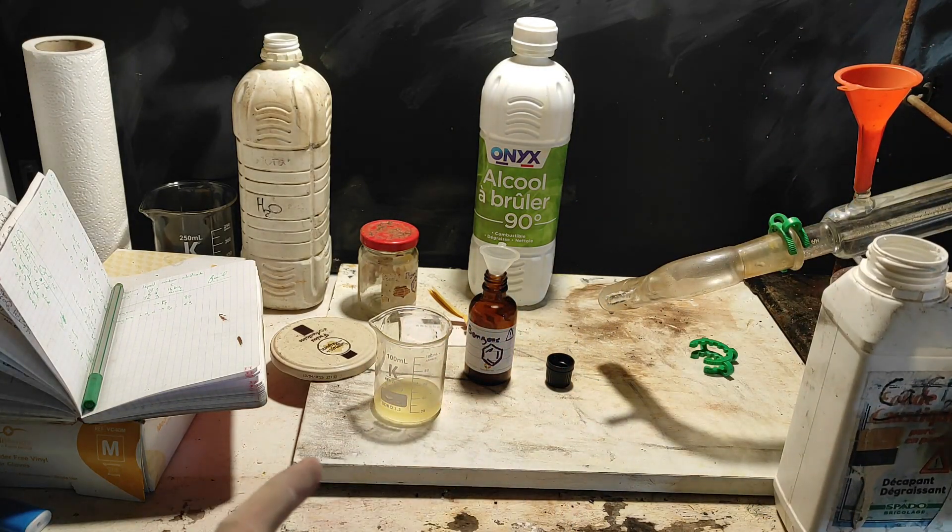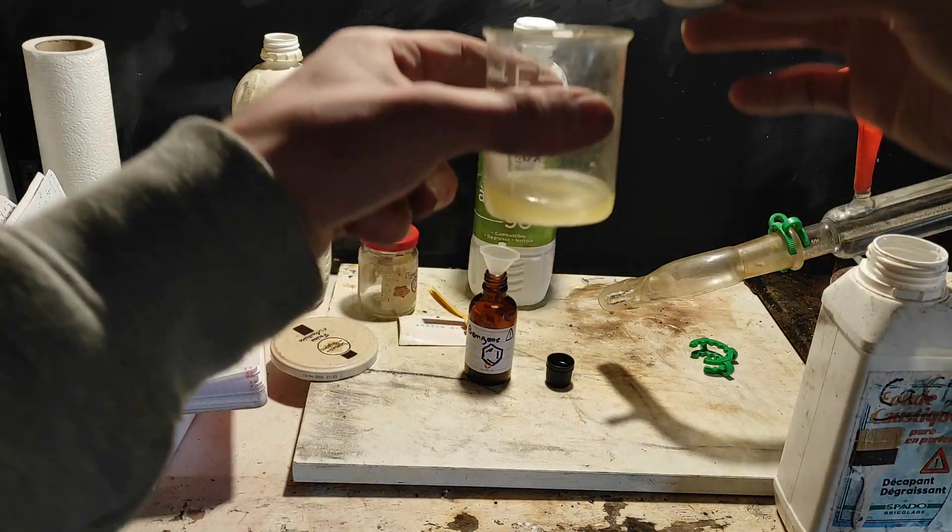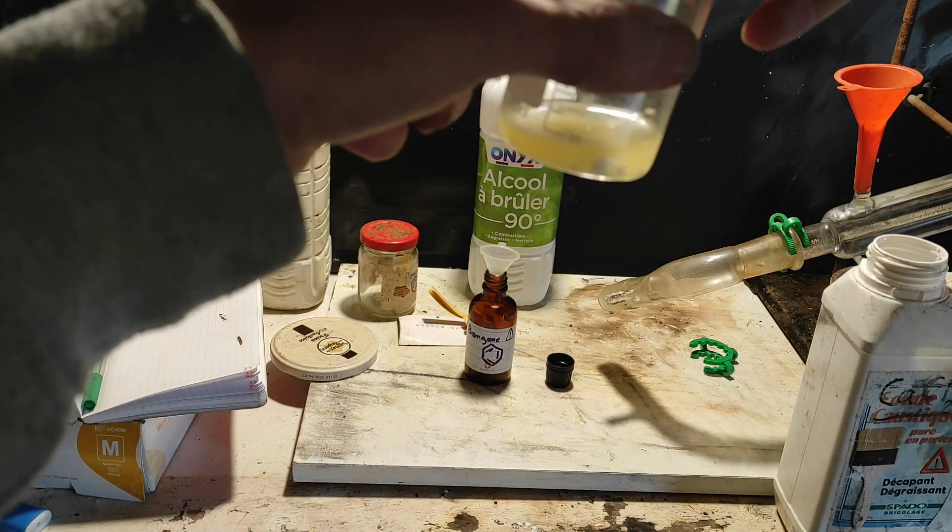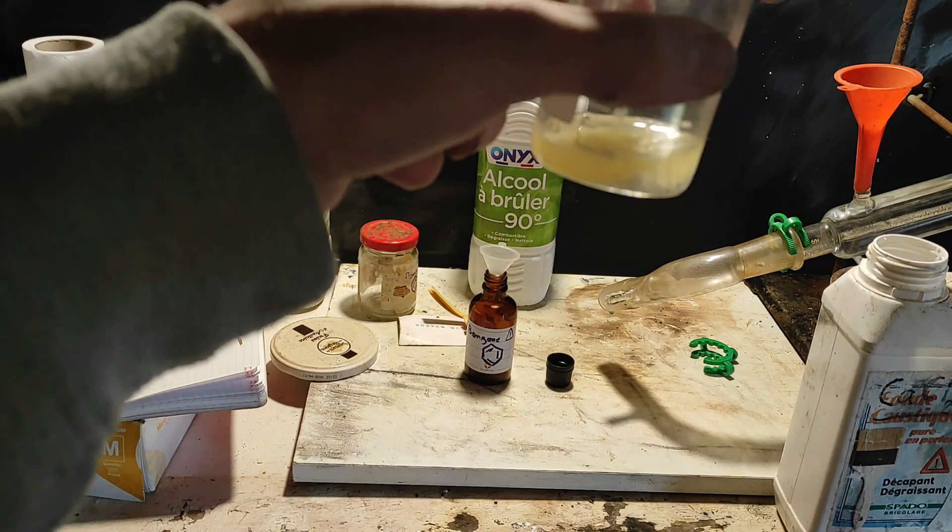I then put some calcium chloride into the cloudy benzene, and stir it to absorb the water. Then, I have this cute brown bottle that I have labeled, and put all of the dry benzene inside it.